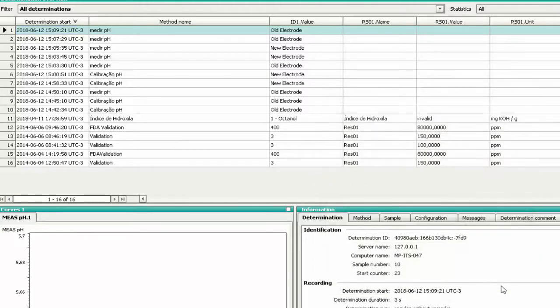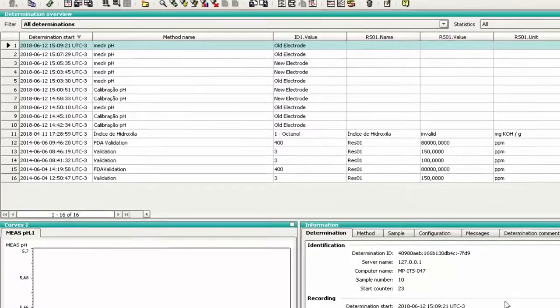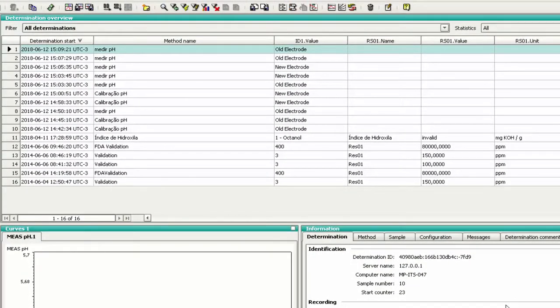The function 'Define Special Filter', being a more advanced search tool, will be explained in another video.